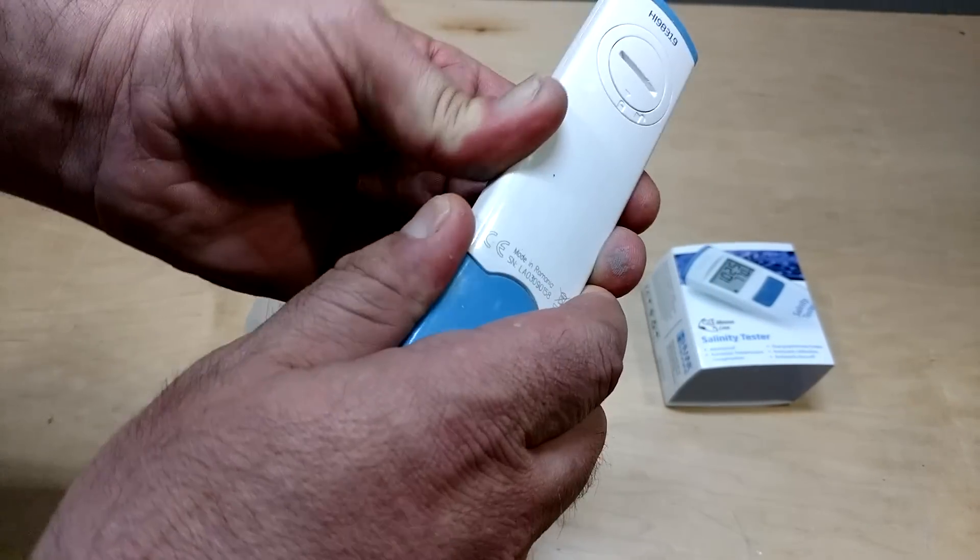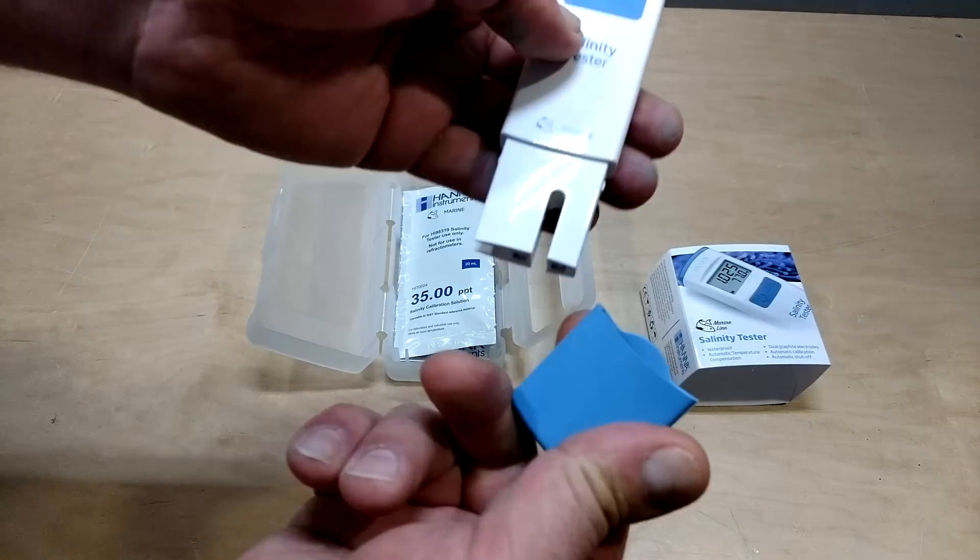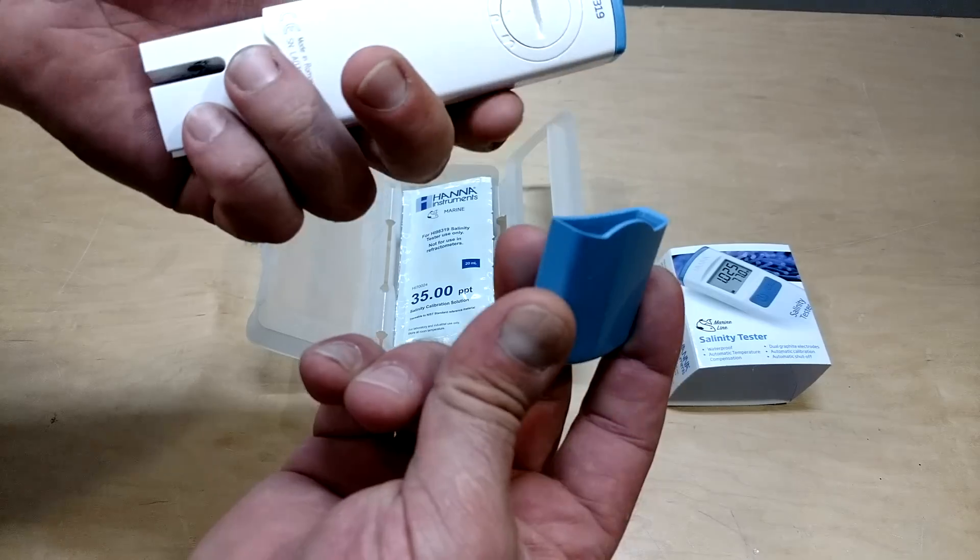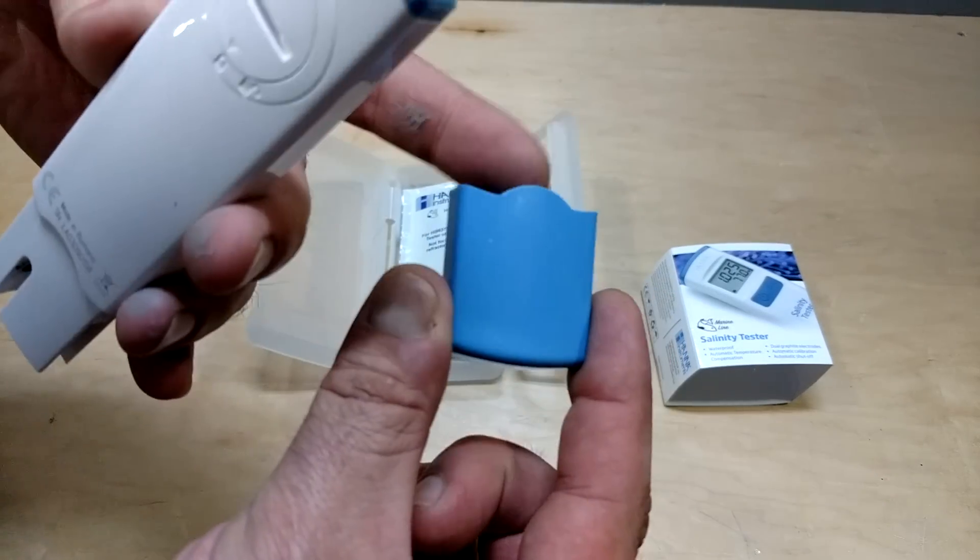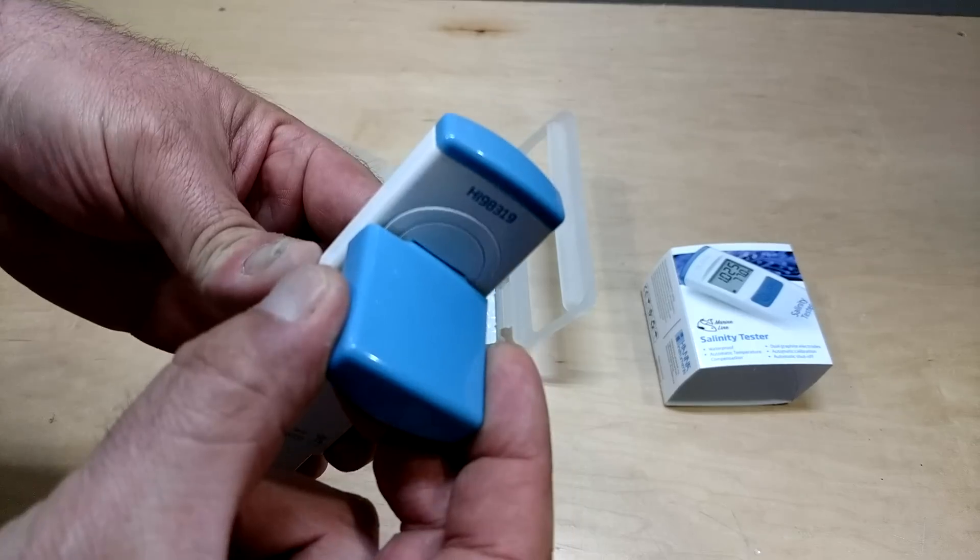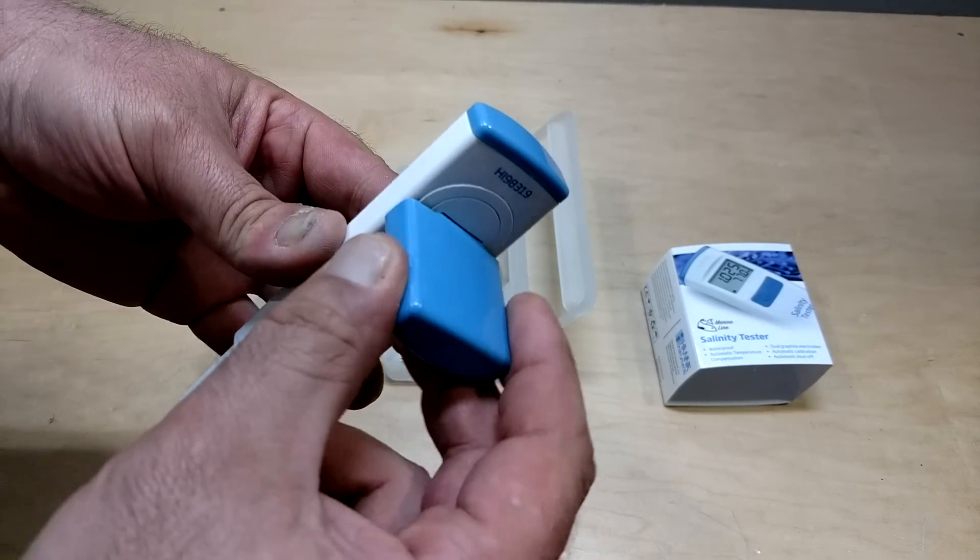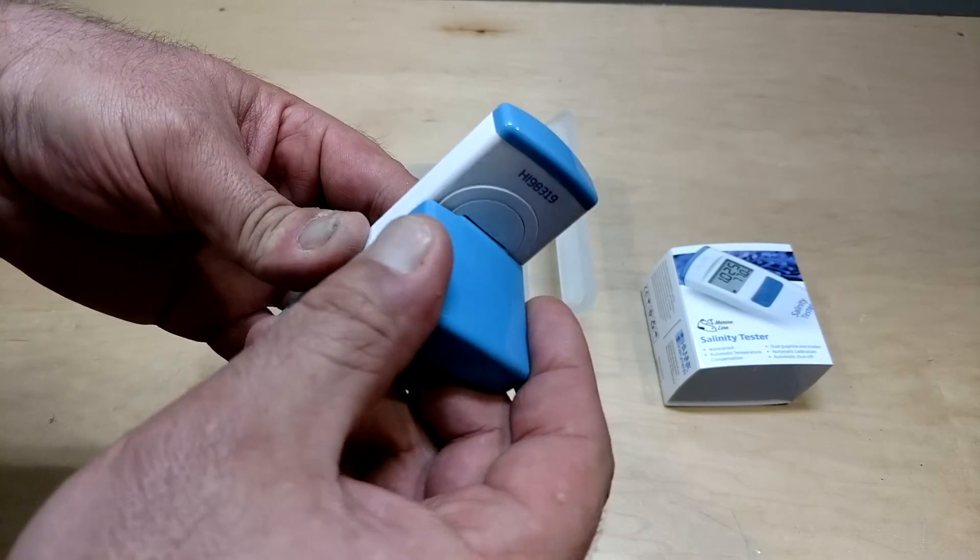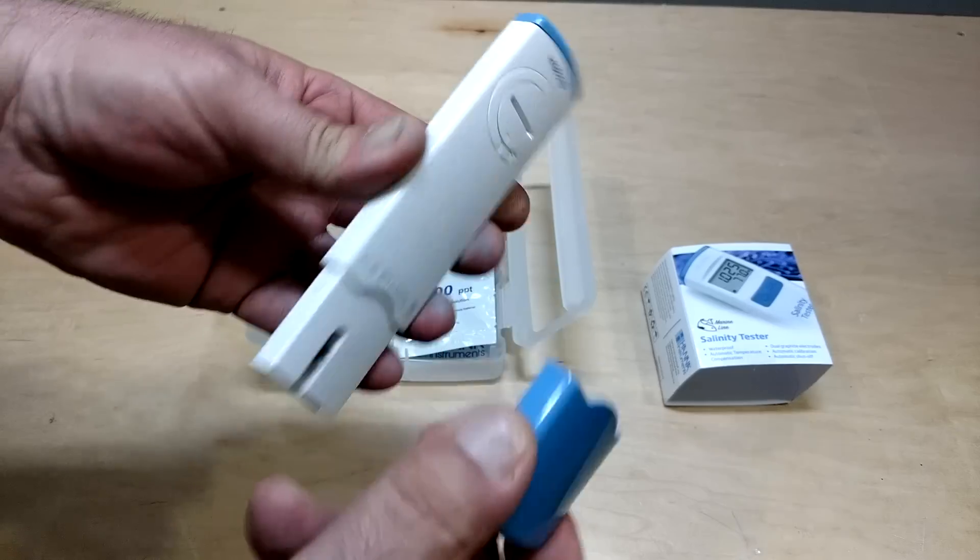But I didn't realize that, you look at this cap and you're like, why can't it just be like this on both sides? Very simple. This is the key for it. Put that in there like that. Look at that. Fits perfectly. Now you can turn the battery compartment to lock it and unlock it. This is the key. So I thought that was pretty cool.